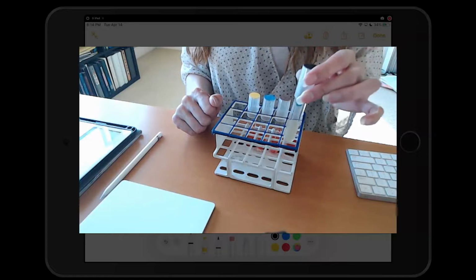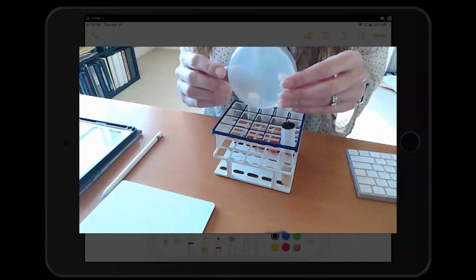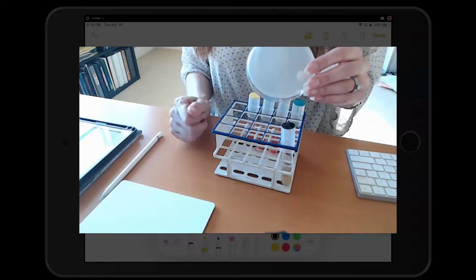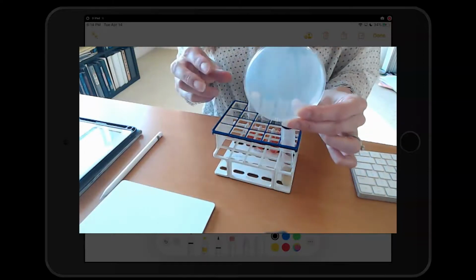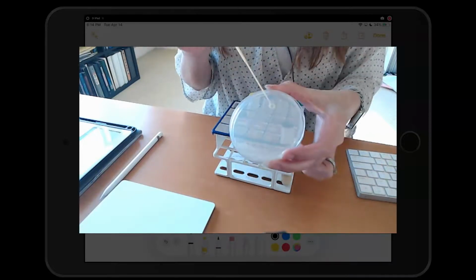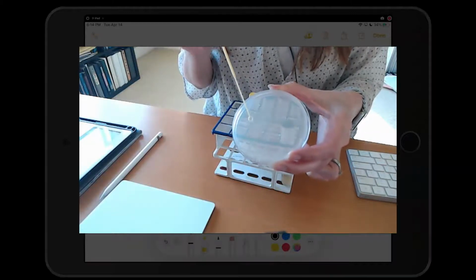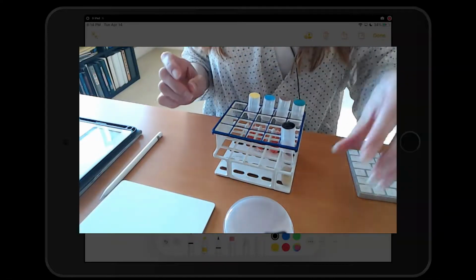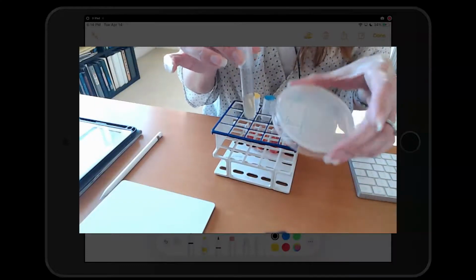The second exoenzyme that we're going to be testing for is amylase. Amylase is an enzyme that breaks down starch. So therefore, we're using a starch agar plate. What we'll do is we're going to inoculate two different controls in a straight line, one on one side, the other one on the other side, and we're going to incubate it at 37 degrees for 48 hours. So these are our two tests for exoenzymes: the gelatin and the starch.